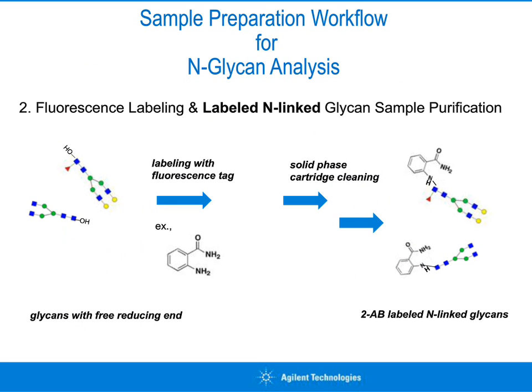Efficient removal of these components away from the labeled glycans will ensure that you get clean HILIC chromatography and provide high-efficiency separations and improved retention without interfering background effects. As shown in the previous slide with the deglycosylation breakdown, I'll do the same with the labeling chemistry and cleanup.